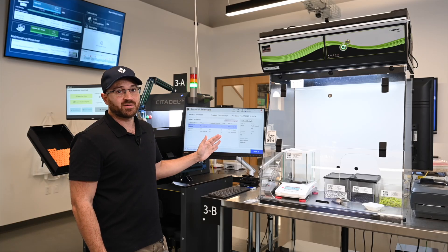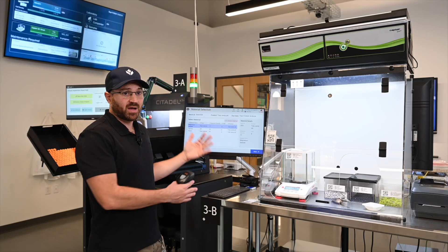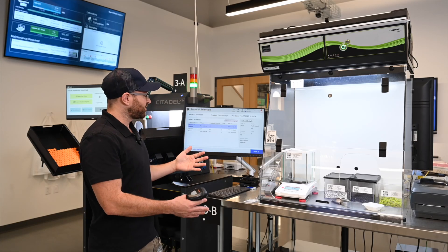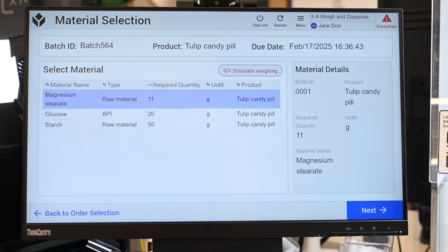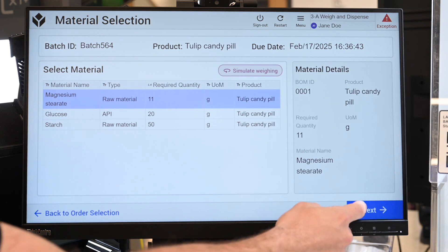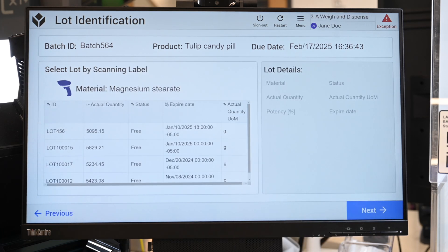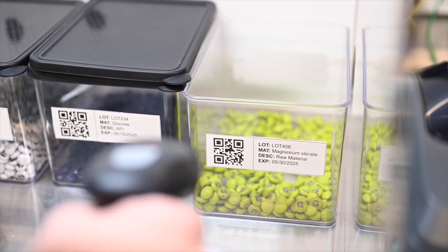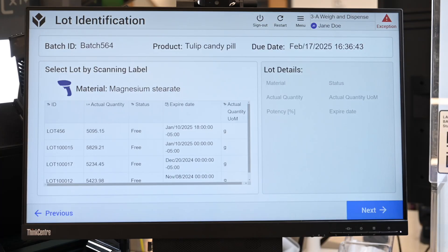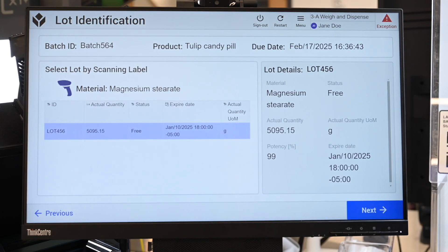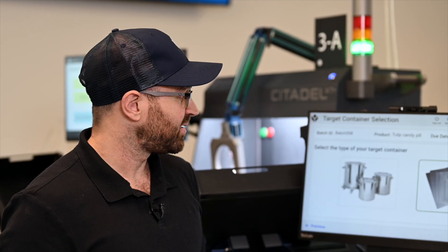Here I have my list of materials that I have to weigh out for this batch. Magnesium stearate is the one I'm going to do first, and I have to scan that lot. This is a valid lot of magnesium stearate, so I'm going to go ahead and use this by pressing next.